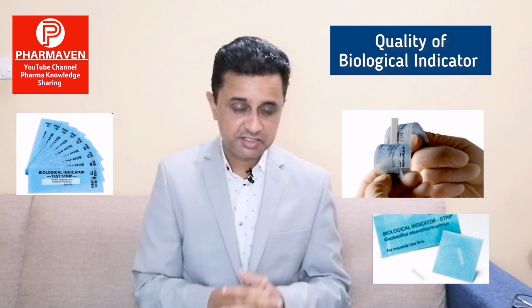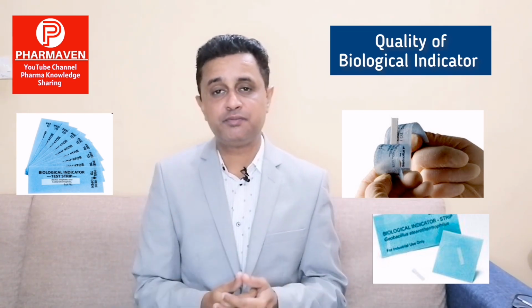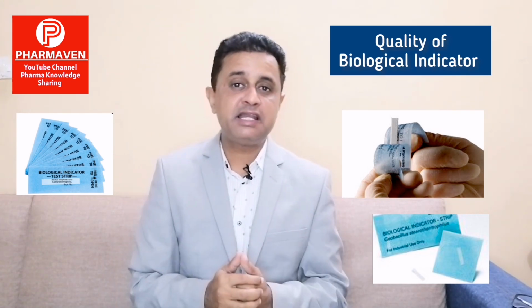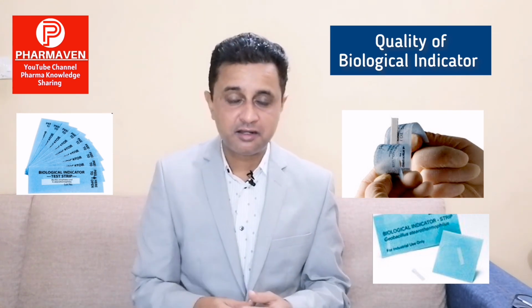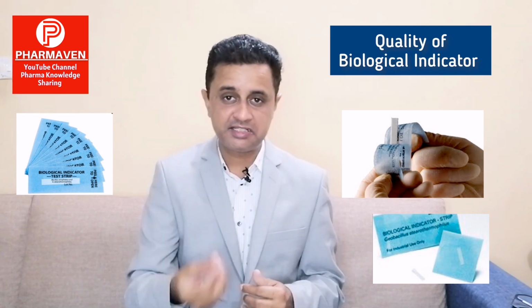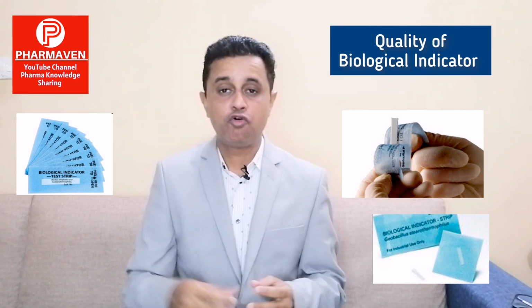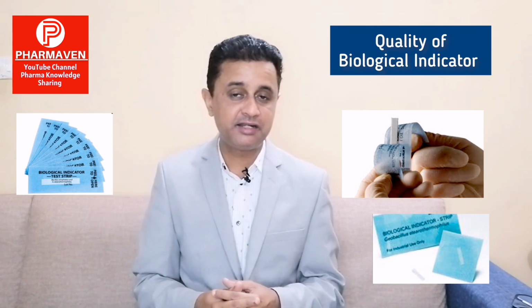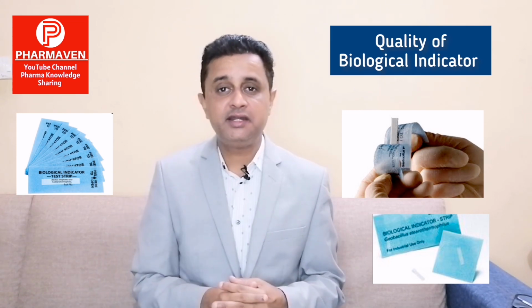So if that storage is not proper, then it may also impact the quality of BI. Once we are taking the BI out of the autoclave, how it is handled matters. Whether by incident the BI strip is open, exposed to the open atmosphere, which may recontaminate the biological indicator, then also it can impact.